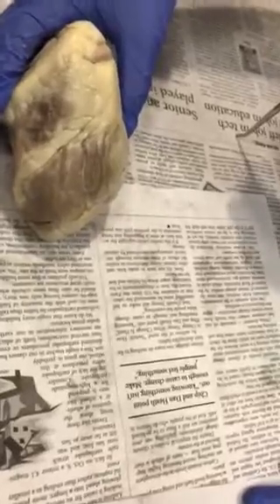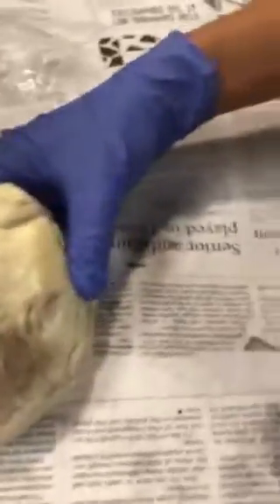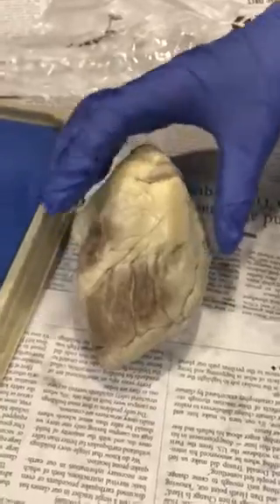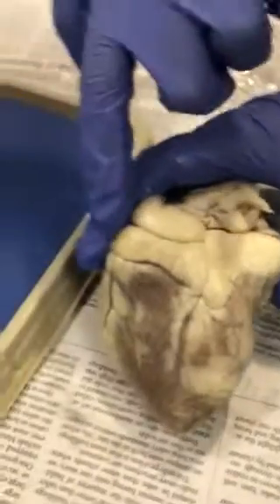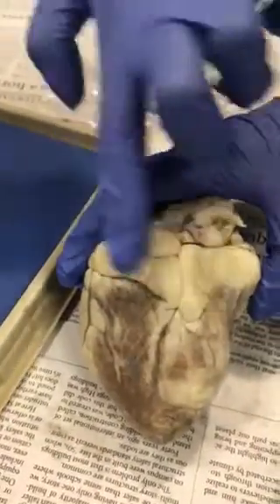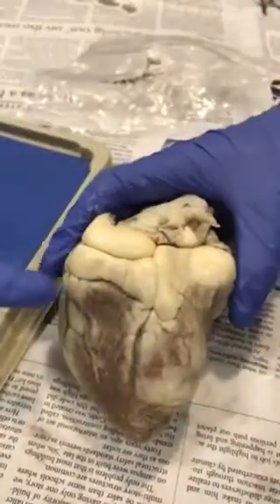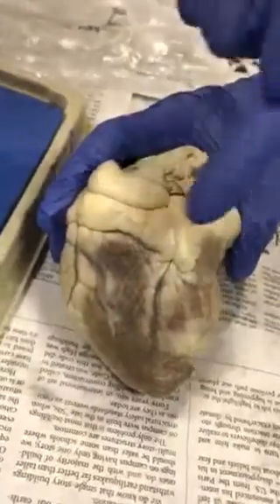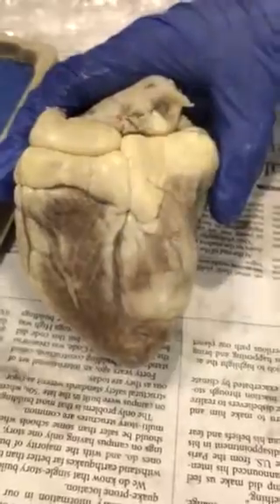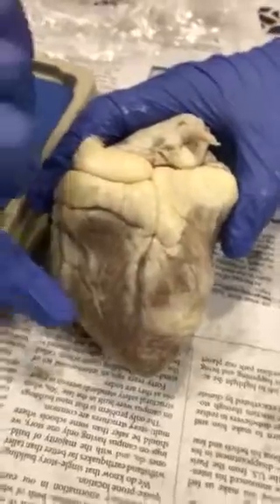Okay, and then I need the coronary veins. Oh, yeah. So then I wanted to talk about the coronary veins, which are also on the posterior side of the heart. There are three major ones that I wanted to talk about. There's one big one that runs right along here. You can't really see it. There's a lot of fat on this heart, but it runs right along here. It's called the great cardiac vein. And then from there it extends down. See this vein right here? That is called the middle cardiac vein. And then there's a littler one right here called the small cardiac vein. Those have extensions of even smaller veins, but those are the three big ones that we should know about.